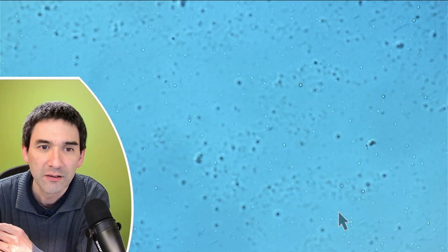Sometimes if you've got two air bubbles next to each other, you can actually see how those fat droplets kind of stream around the air bubble as well. So one of the things that I could try is I'm just going to take my tweezers, and I'm going to now press down on the cover glass itself, and maybe this will also induce some kind of a directional motion. So I'm going to quickly press down on the cover glass. As you press down, then you're pushing the liquid away, and then you can of course also see that this is directional. So I think you get the point.